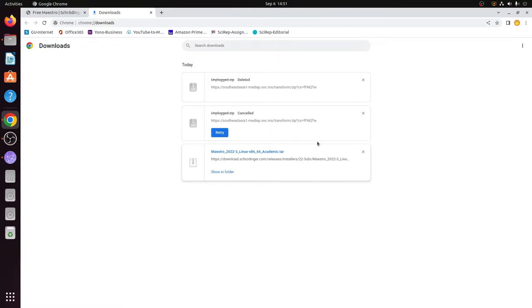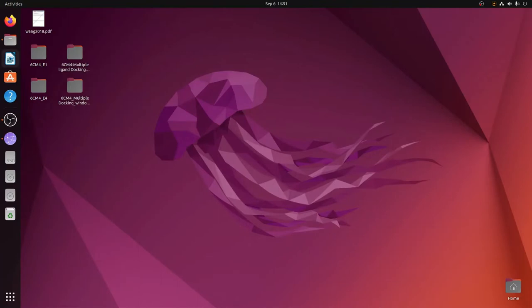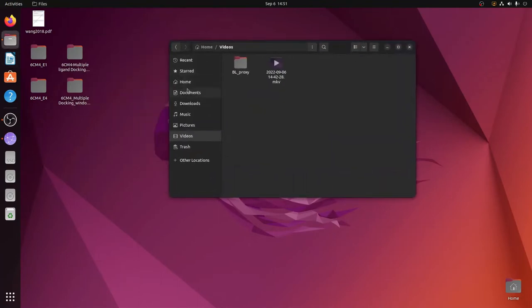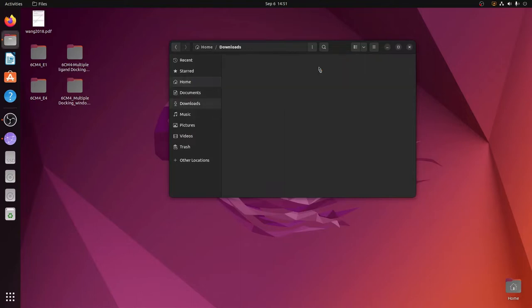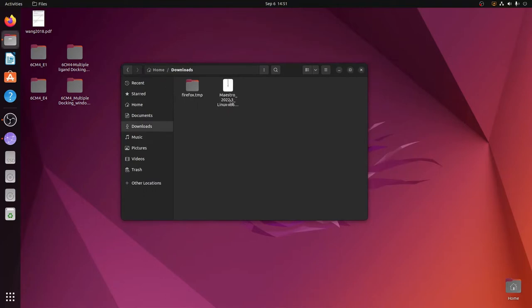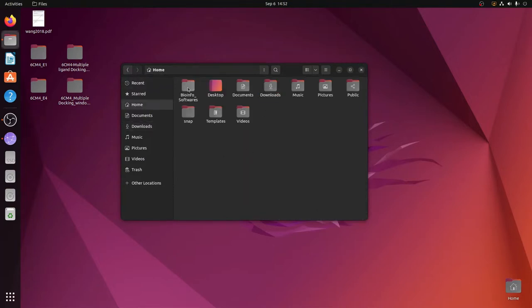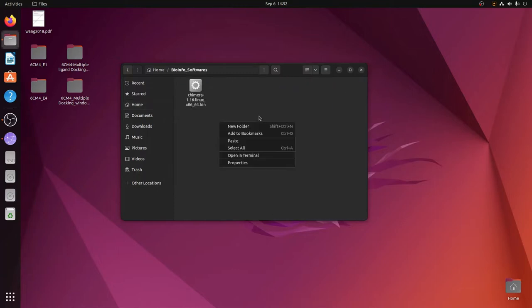The file has now been properly downloaded in the .tar format. I will close the browser, go to the home directory, and within the home directory there is the Downloads folder. Here is the file we downloaded. I will copy it from here and put it into a more accessible location — a folder I created called 'bio_info_softwares'. I created this folder in my previous video. I will paste it over here.